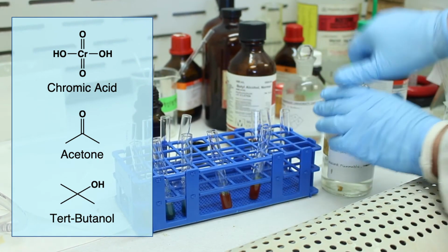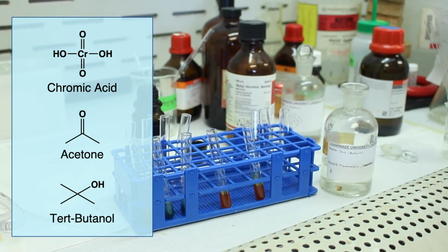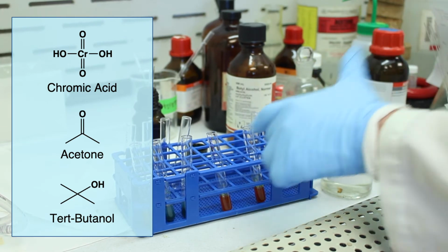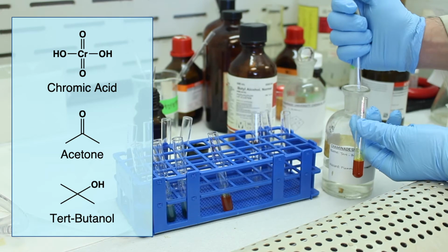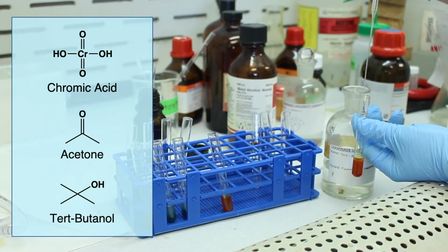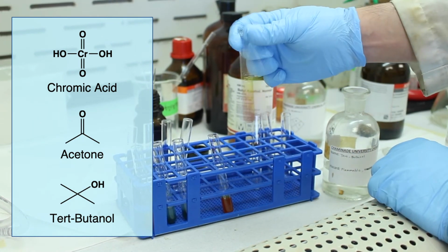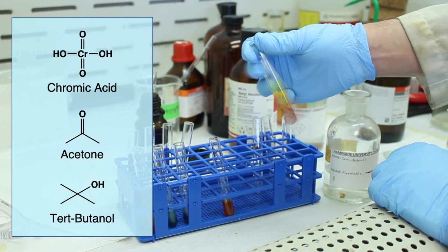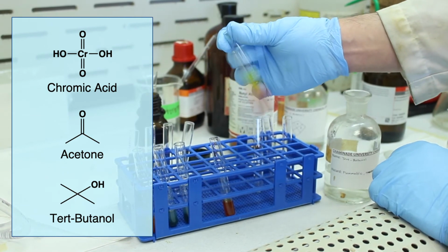Oops, it's a little stuck here. It will not be oxidizable. So when we add it, we expect there to be no color change. It will remain the same. It should look identical to the control. So here's our tert-butanol. Okay, and if we agitate, yep. So no matter how hard I agitate this, it will not react.